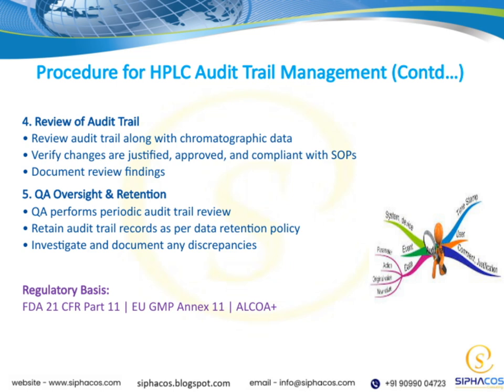Moving on to QA oversight and retention, quality assurance plays a vital role by performing periodic reviews of the audit trail. This ongoing oversight helps maintain data integrity over time. Additionally, we must retain all audit trail records in accordance with our data retention policies. This ensures we have access to historical data if needed. If any discrepancies are identified during these reviews, it's important to investigate thoroughly and document the findings to maintain transparency and compliance.